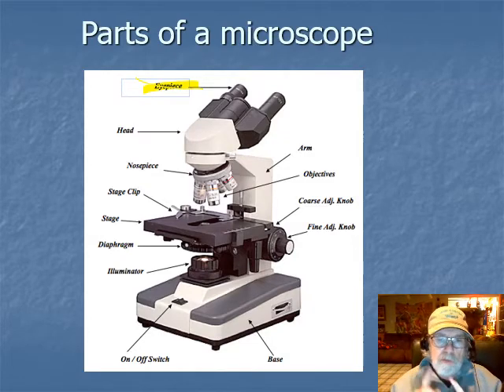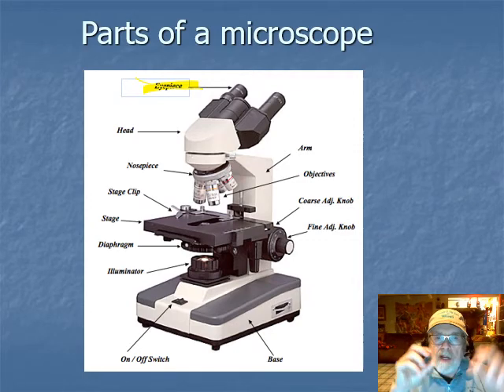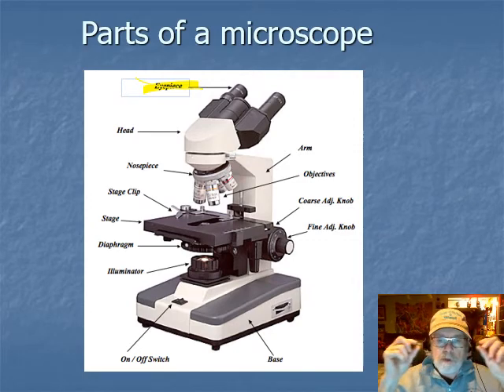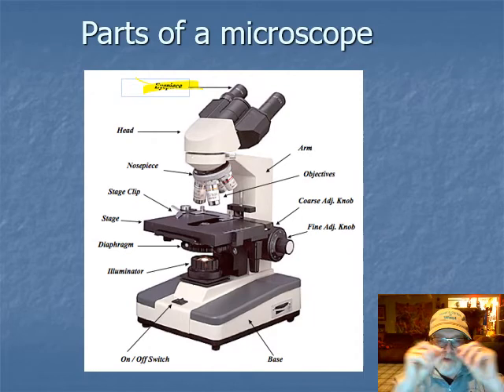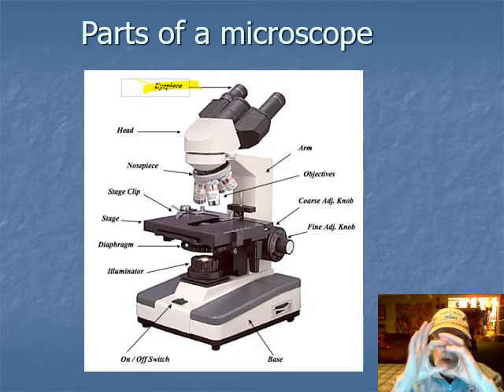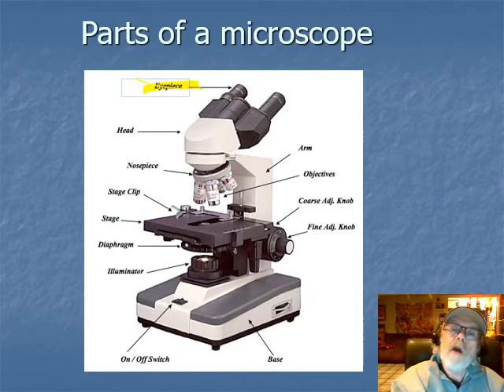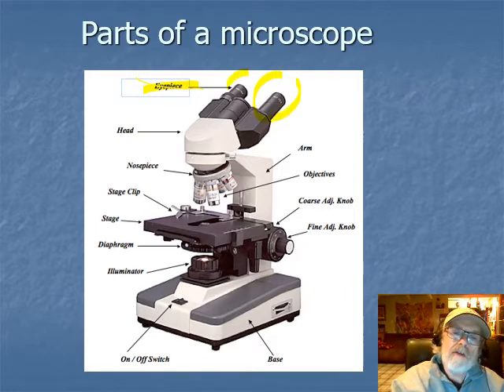The eyepieces can move back and forth to accommodate what's called the pupillary distance. Pupillary distance is the distance from the pupil on one eye to the pupil on the other. Most binocular microscopes have the ability to move the eyepieces to get your pupillary distance just right, so you have one single solid circular field of vision.